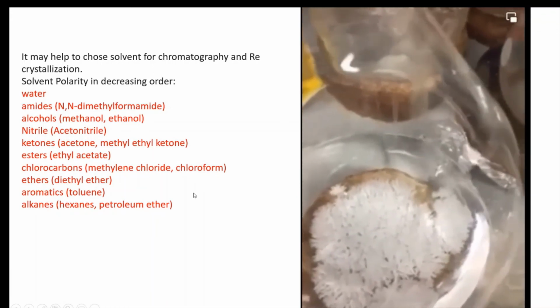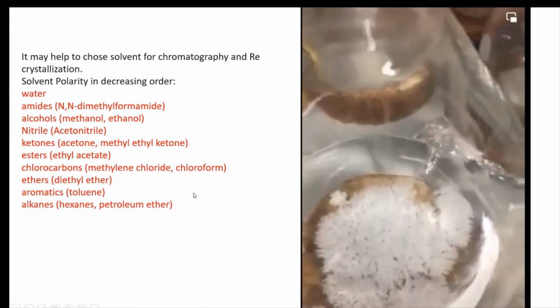The funny thing is the residue from NBS, like succinimide, can dissolve in acetonitrile. So your impurity will stay in the liquid acetonitrile, and you will get your crystalline solid as your product.